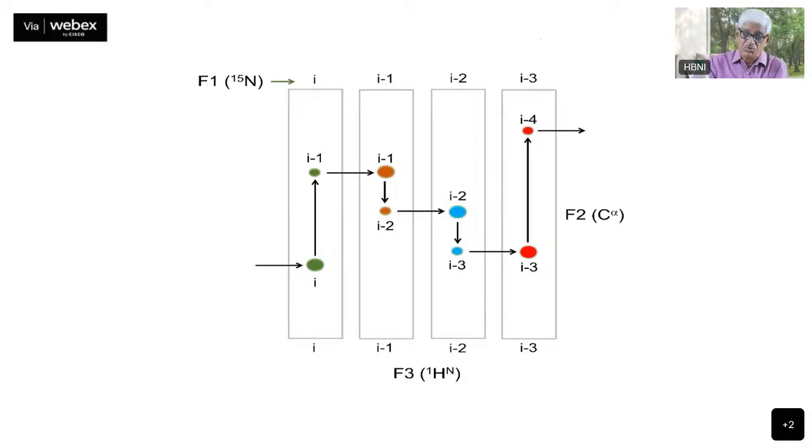And you have made use of 3 chemical shifts: amide proton chemical shifts, nitrogen chemical shifts, and the carbon chemical shifts. And all of these are extremely useful. I think we probably end here.